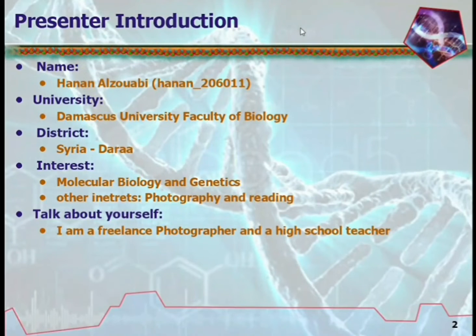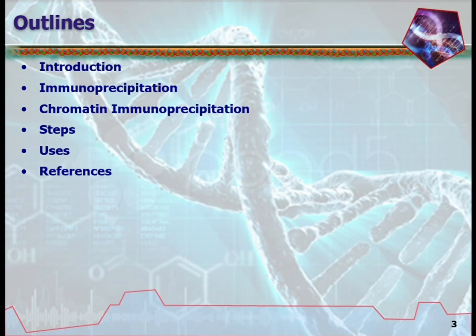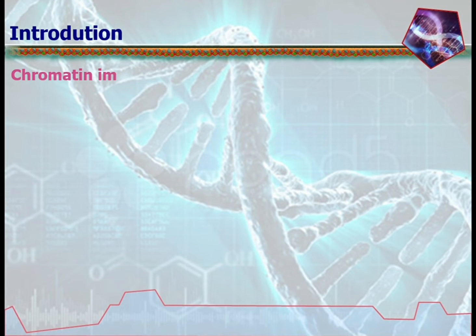I'm a bioinformatics student and today I'll be talking about ChIP technique. ChIP stands for Chromatin immunoprecipitation. Before we start, let's talk about some concepts we need in order to understand ChIP technique.